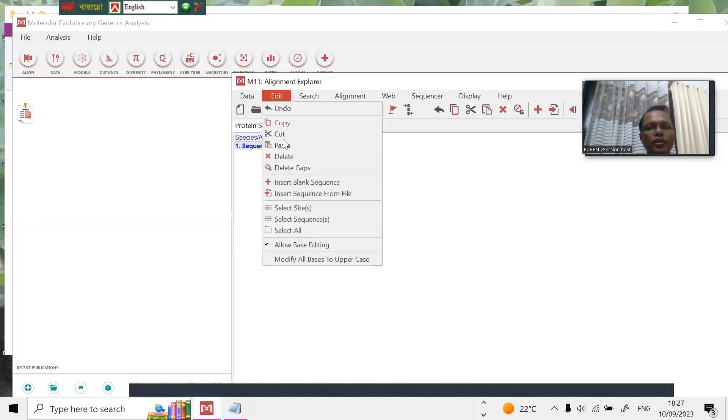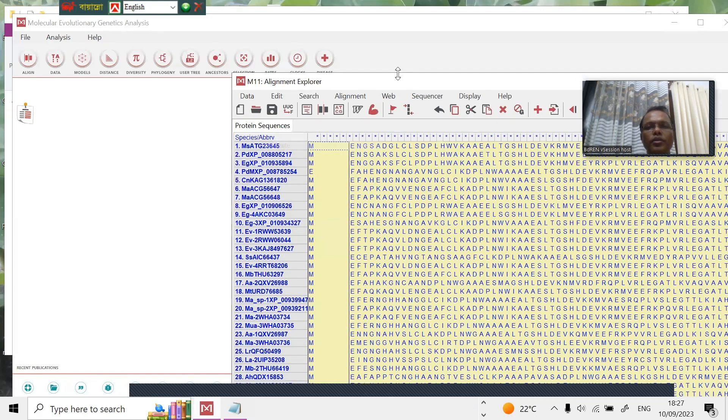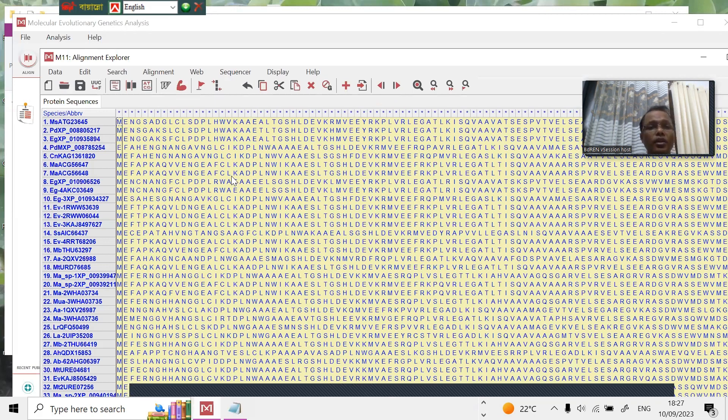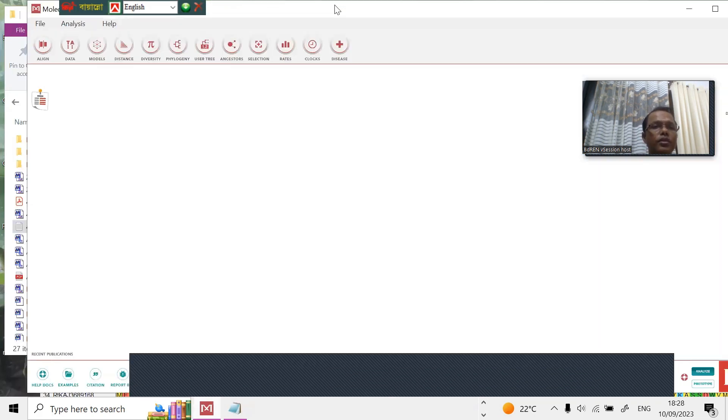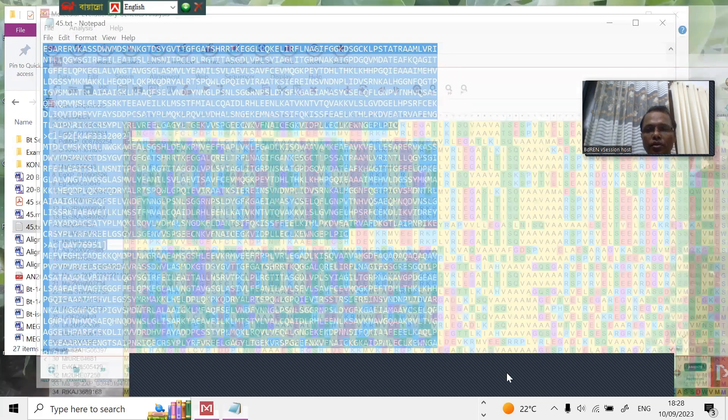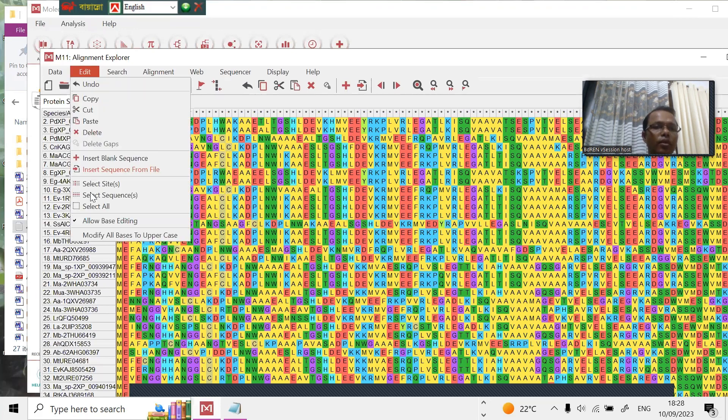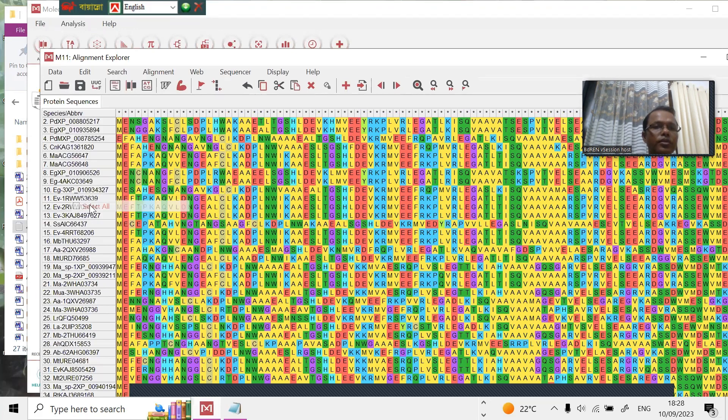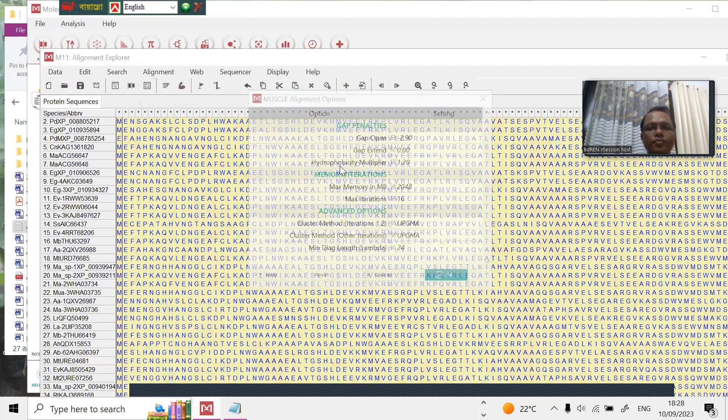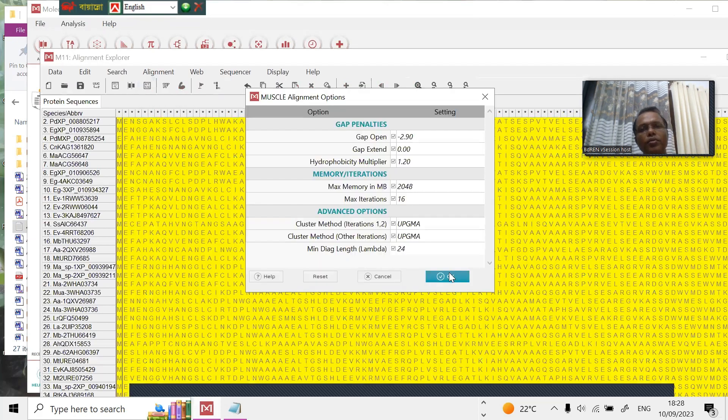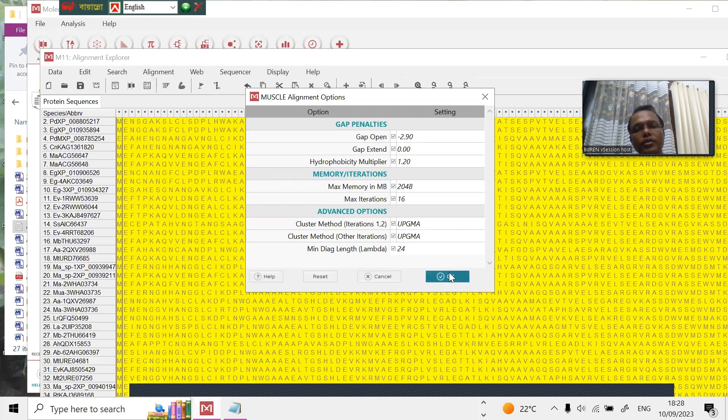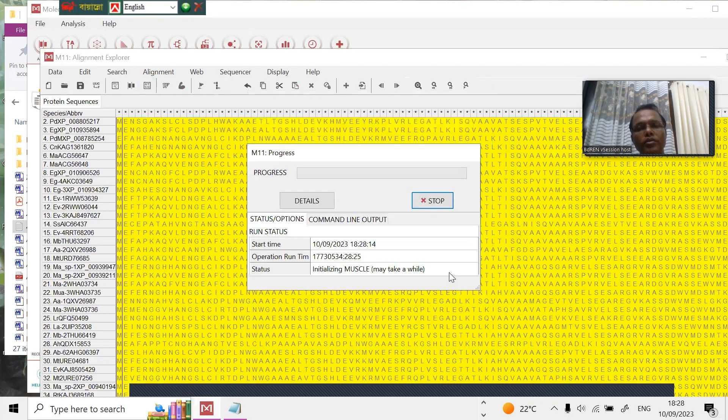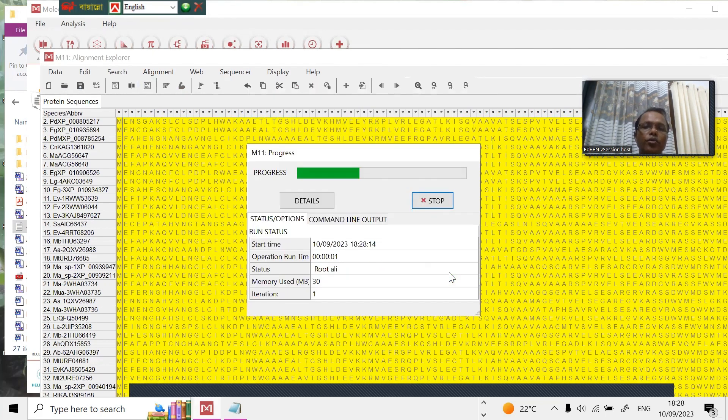Now we can see all the sequences are here, the 45 sequences, and then we have to align. In that case, we select all the sequence and align with MUSCLE. We use the default system UPGMA. It's progressing.